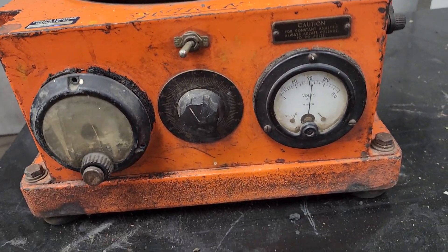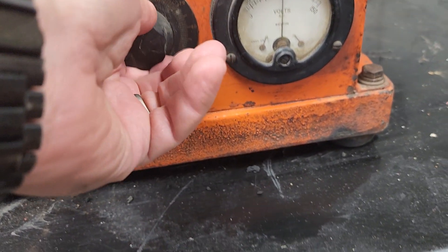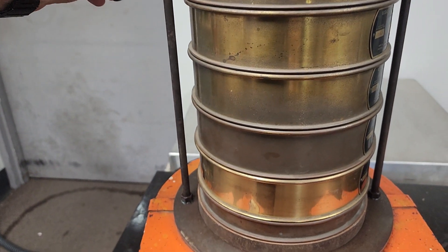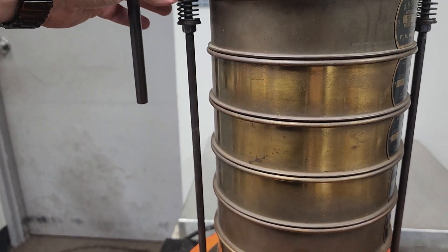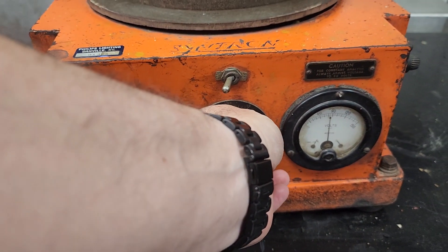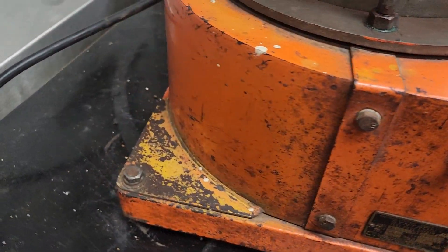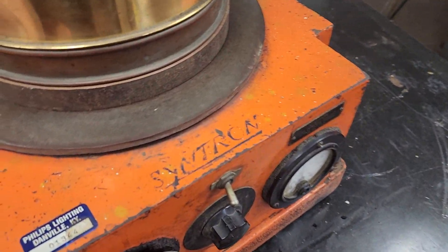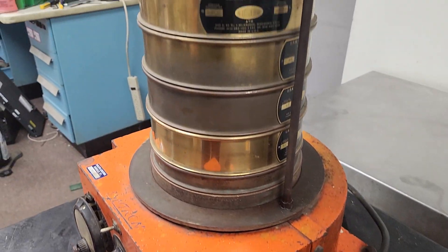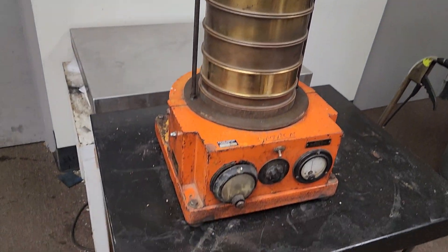I'll let you hear it work. See, that shakes a little bit. Works good. It's sitting on this cart so it's going to move a little bit. That's the unit. It's pretty heavy — I'm going to say it's about 150 pounds, so it's definitely going to have to be freight shipped. You got questions or concerns, let me know. Thank you.